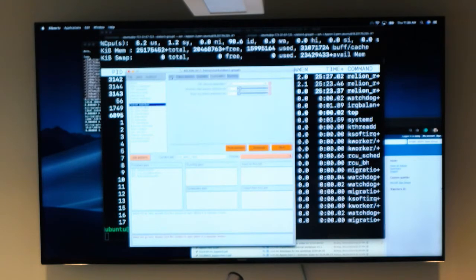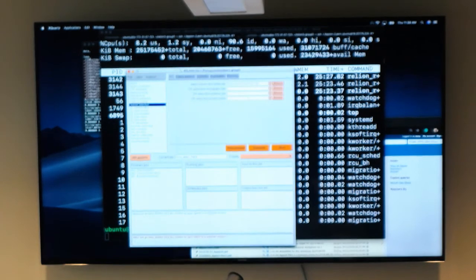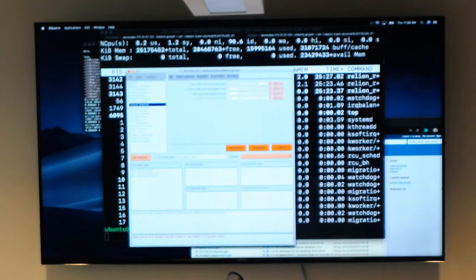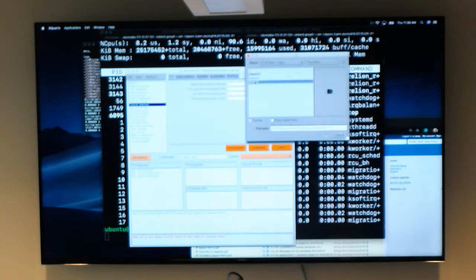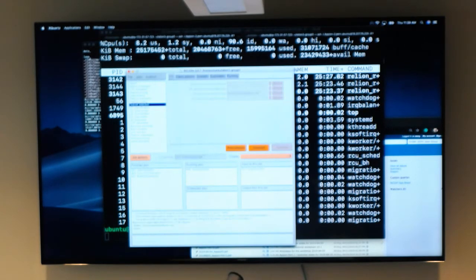So if you already have an existing star file, you can choose a star file. In this case, I'll choose a selected star file and I can say, yes, I just want to remove duplicates. Particle star files. Not this one. This one. And it'll remove duplicates. In this case, it picked really well.